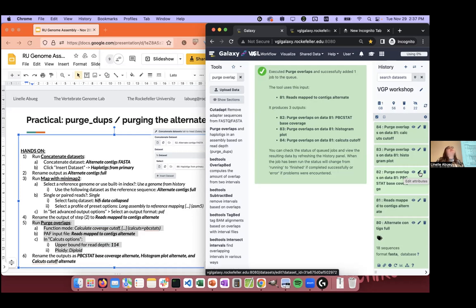I mean, the low read depth stuff will be there. It's just that when you have more actual coverage of what you want, it'll move further away, so it can more clearly identify what's error versus what's real sequence. That's just that low coverage, yeah. You mean like the haploid? Yes, the haploid peak. Haploid sequence.